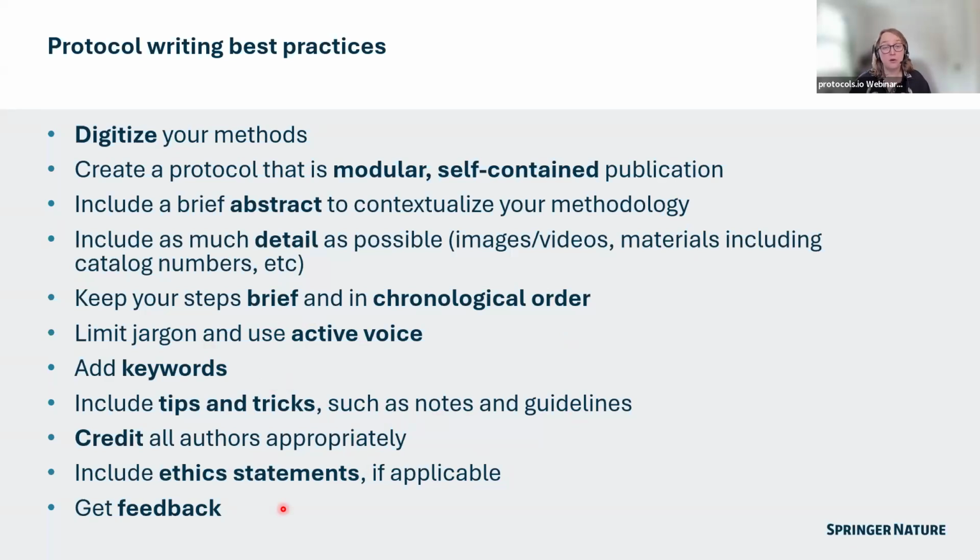Sometimes you write a protocol and there's certain things that are just muscle memory that you don't think would need to be included. And if you're able to get feedback from someone else, they might point out, hey, this protocol would really benefit from you detailing what to do between these two steps or expanding on this term because it's a term that maybe you know, but I don't know. So I really encourage you to follow all of these best practices when you're writing your protocols.